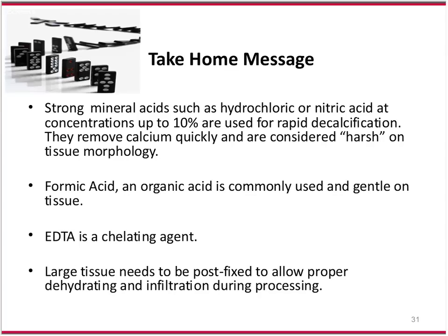Formic acid, an organic acid, is commonly used and gentle on tissues. As I said, formic acid can be made in your lab, or it's also available commercially. EDTA is a chelating agent. That also can be bought commercially or made in your lab at varying concentrations with varying pHs. I've seen an 8% EDTA all the way up to 20% EDTA. We use a standard 14% EDTA in our lab.